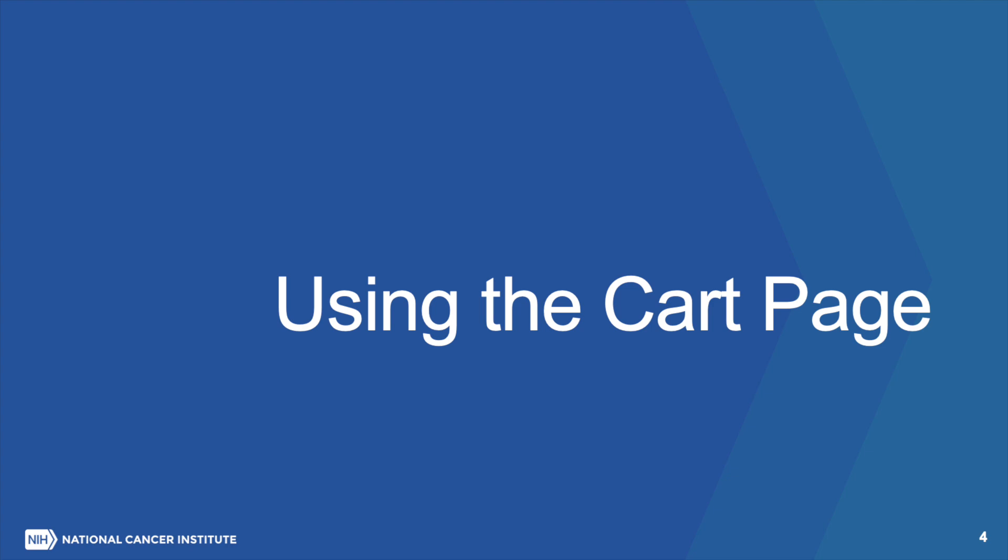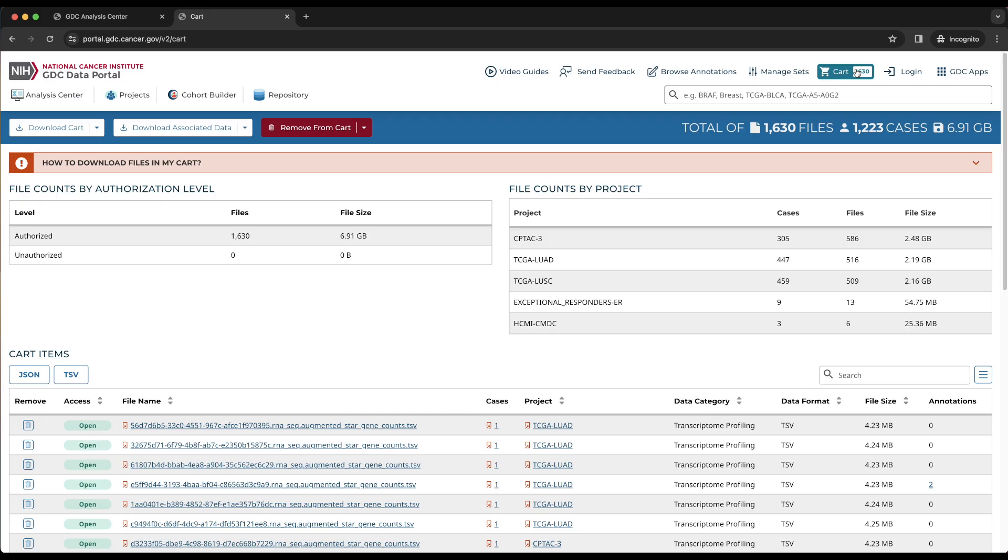Using the cart page. The cart page has three tables with information about the files in the cart. The table at the top left tells us which files we are authorized to download. Since they are all open access files, we are authorized to download all of them. The table at the top right gives a breakdown of the files in the cart by project. This includes the number of represented cases, number of files, and the total file size for each project.